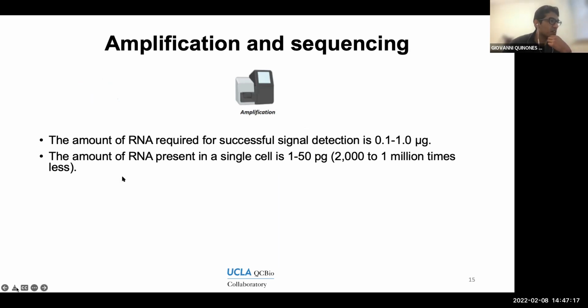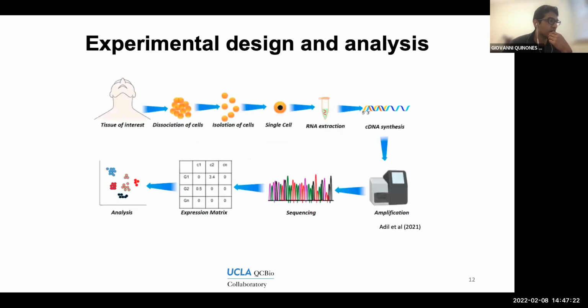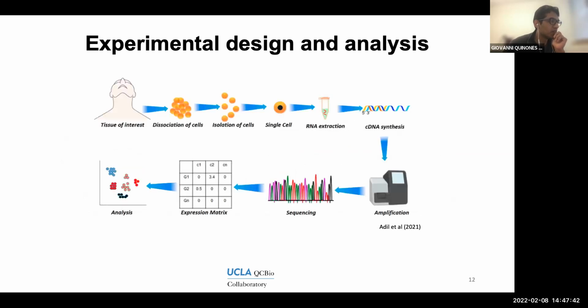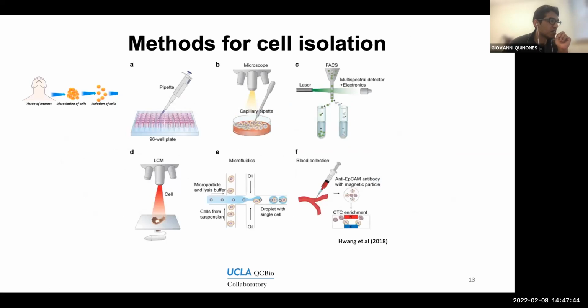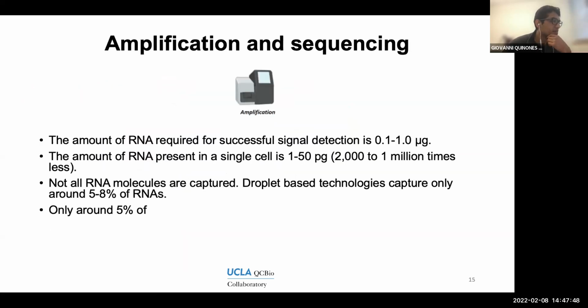I believe with these older technologies, there is like a 10% rate of capture. I can look up the exact numbers because what I'm saying now is from memory, but I believe the overall capture rate difference is not that dramatic. Yeah, okay, thank you.